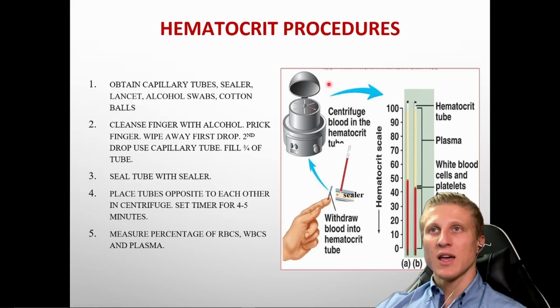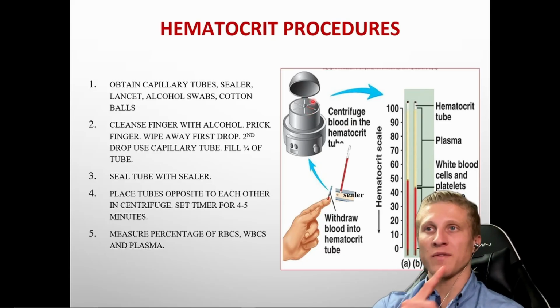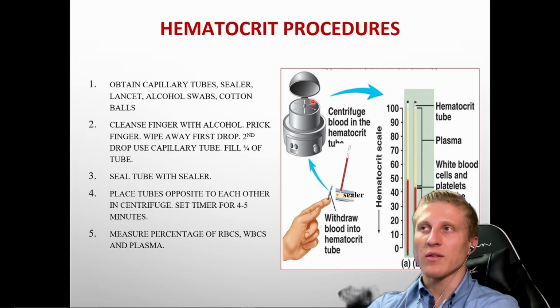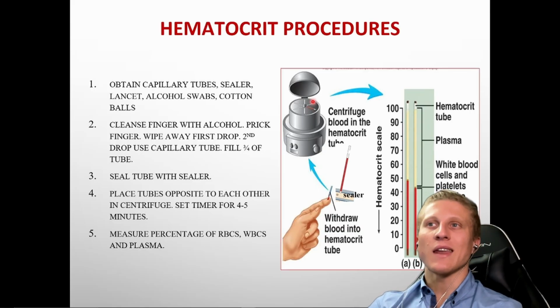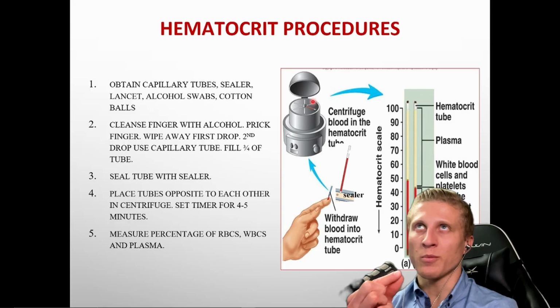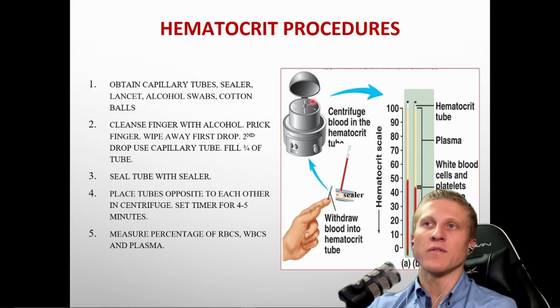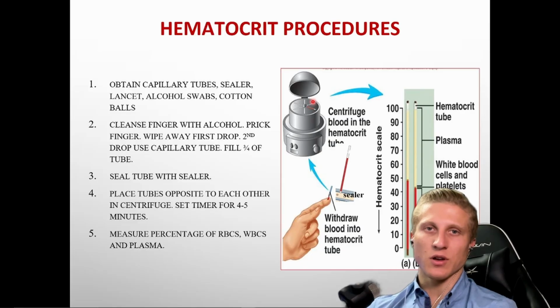And this centrifuge is a device that's just going to spin really, really fast. Think of centrifugal force if you've covered physics before. And when it spins, it's going to apply a g-force. It's going to kind of create an artificial gravity, if you will, within that space. Heavier and denser things are going to go to the bottom of the vial, and lighter, less dense things are going to float at the top.